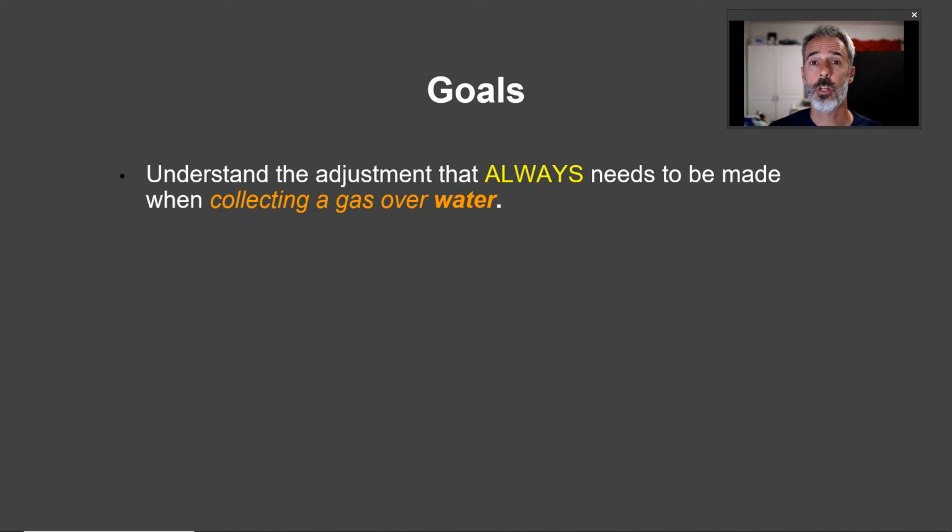In this lesson, we're going to turn our study of gases to a much more practical concern, which is how do I collect a gas in lab if I want to do a reaction? And by practical, I mean this is our next lab. This is what we're going to be doing.